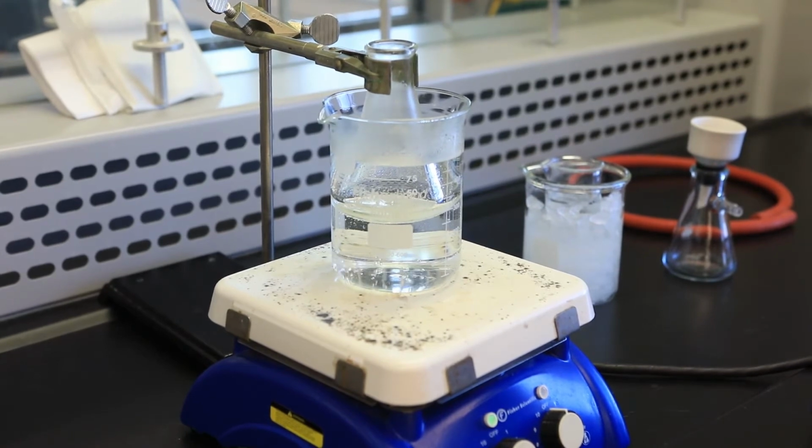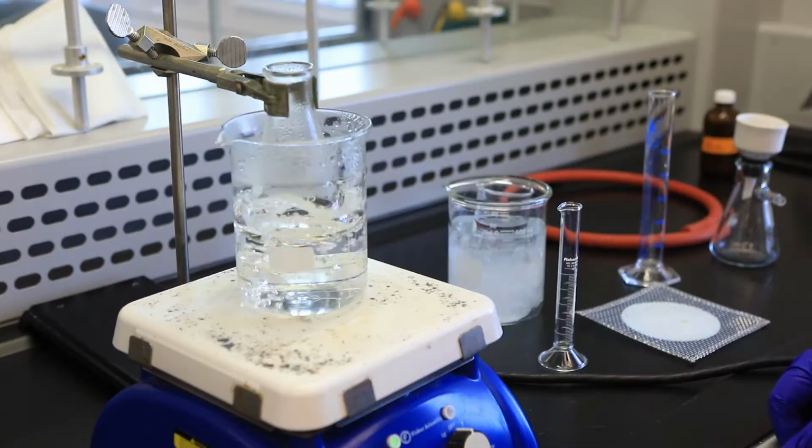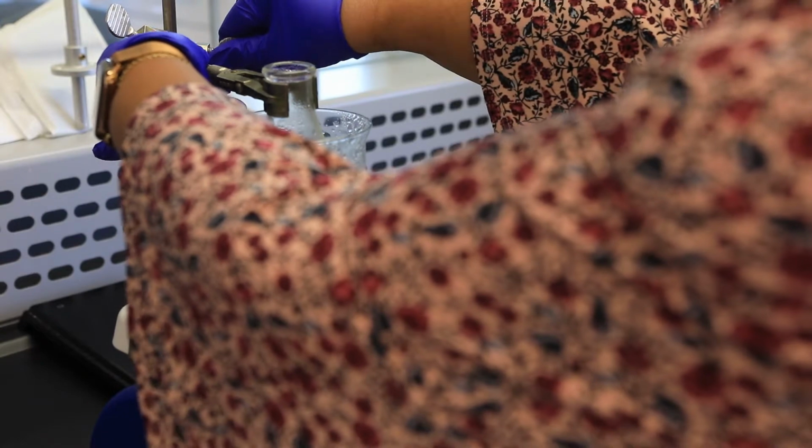Upon completion, we will then add our cold water to initiate the crystallization process. So after 20 minutes of heating, I'm going to remove the reaction vessel from the hot water bath.